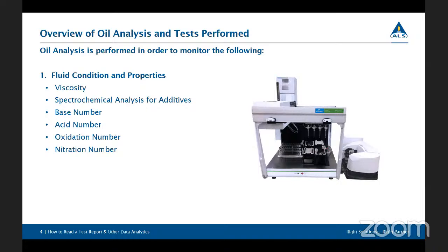Next, we can do a spectrochemical analysis where we're looking at the metals, those elements that are inside the oil. For those that aren't very familiar with fluids, there's actually a lot of different elements that are added into a lubricant to make sure that they perform in the environment that they're in, whether it be an extreme pressure additive, or sometimes an additive so that they can handle the harsh environment inside of an engine. And so we want to test and make sure that those additives are there and that they're in the correct ratio for the product that's in use.